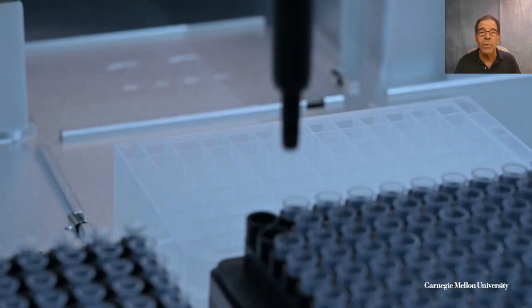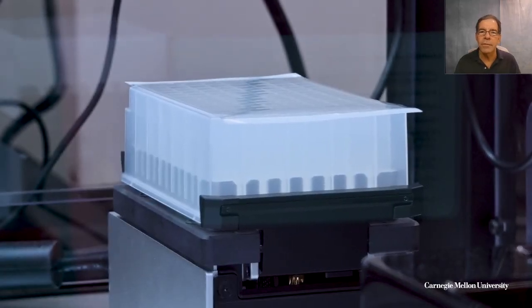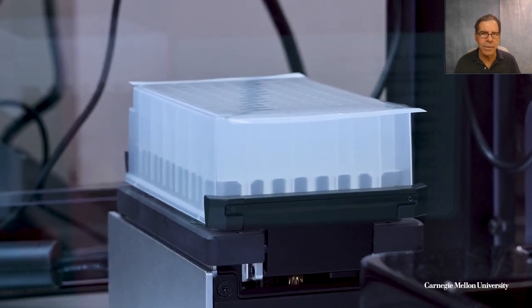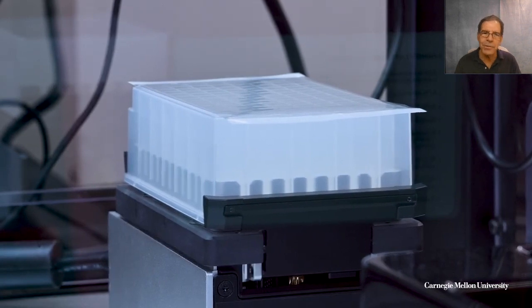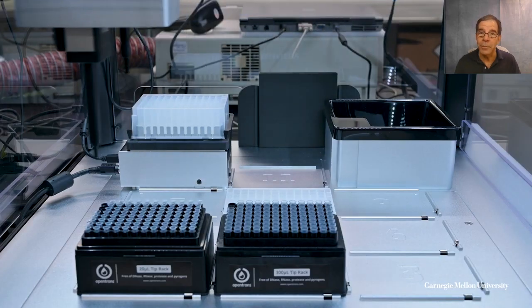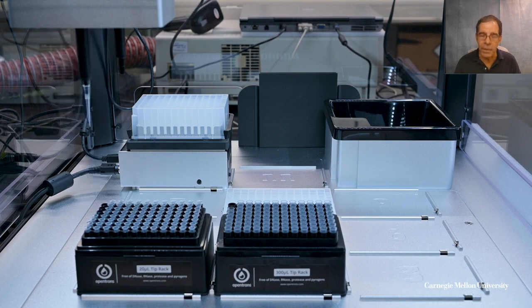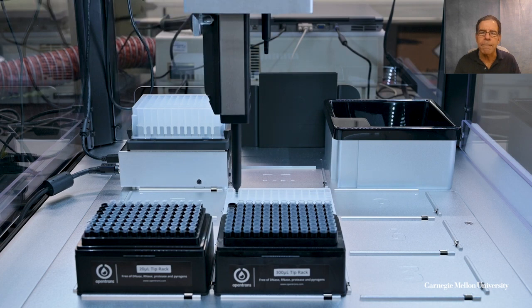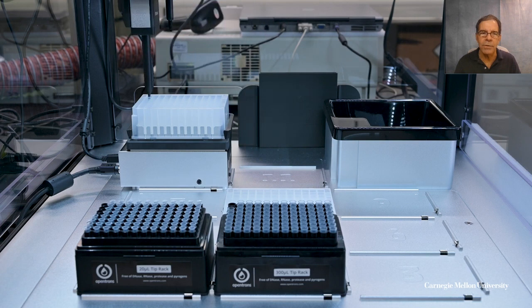And it's interesting that when it first tried to carry out this procedure, it made a mistake in the code it wrote to the device that heats and shakes liquid samples. But then, without any prompting from the Coscientist team, it spotted the problem, referred back to the technical manual for the device, corrected its code, tried again, and this time was successful. The final lab results were verified, and they did indeed contain the hallmarks of a true Suzuki-Sonogashira reaction. It did it. Amazing, huh?